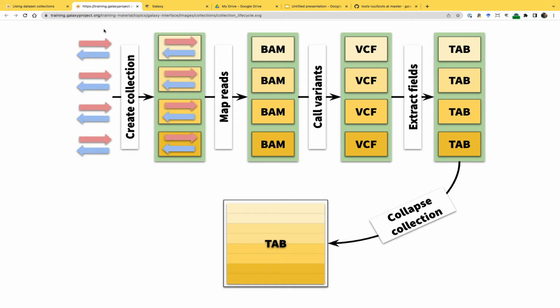In this RNA-seq example, we're also going to have hierarchy, but it will be a different hierarchy. It will have more layers because we will add different factors to it. So we'll have males, females, smoking, non-smoking, affected and unaffected, this kind of thing. So you can nest it as much as you like.